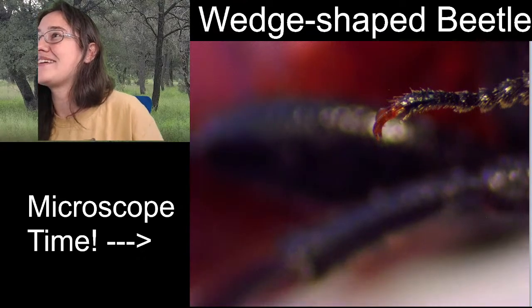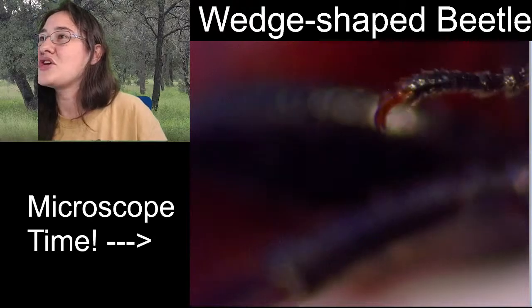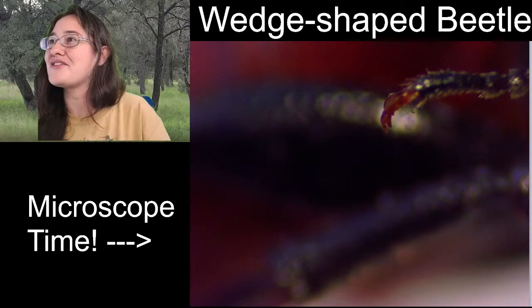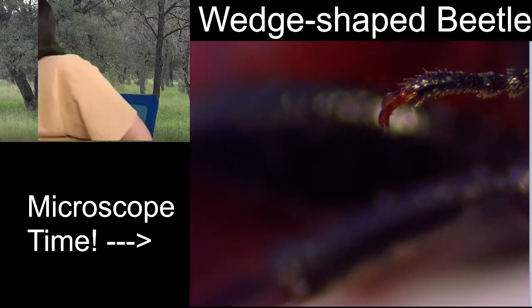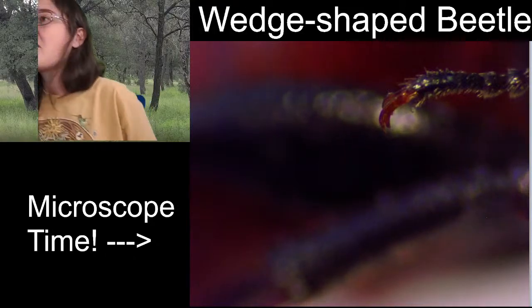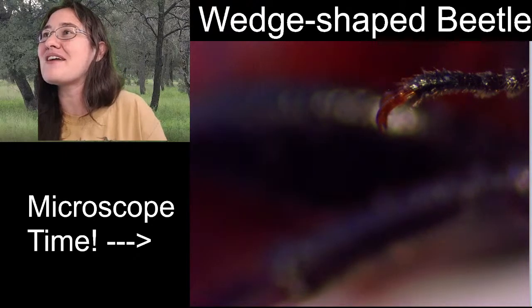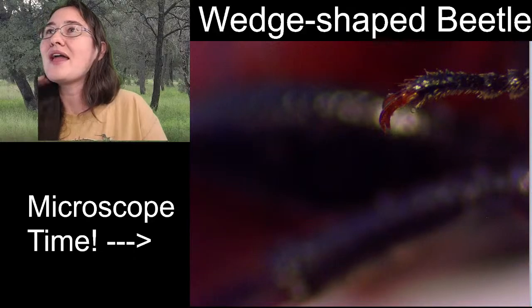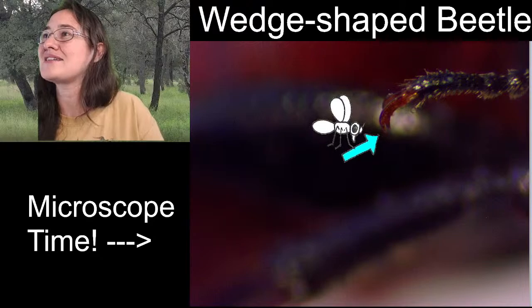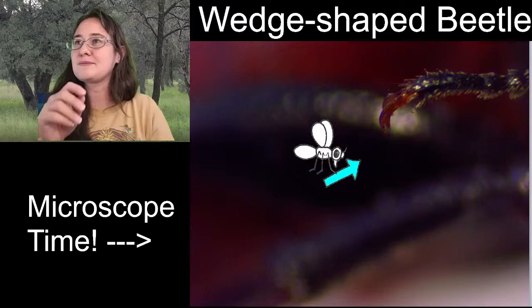Yes. You'll be able to see it, I think. Because of the way that the glare is coming through the other side, this is one tarsal claw at the very, very end of its tarsal segment. And right here, you can see the split at the end, because you can see the little bit of light coming through.